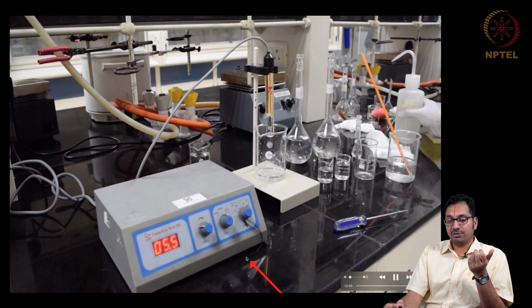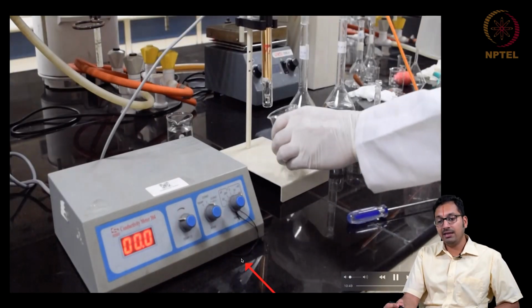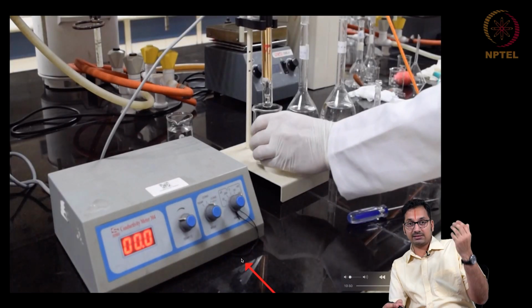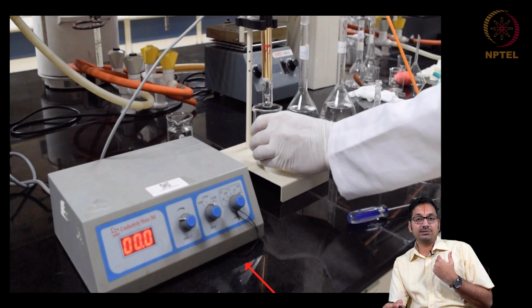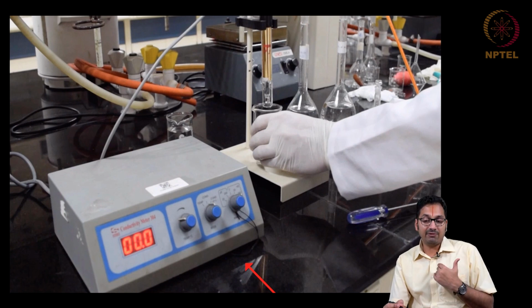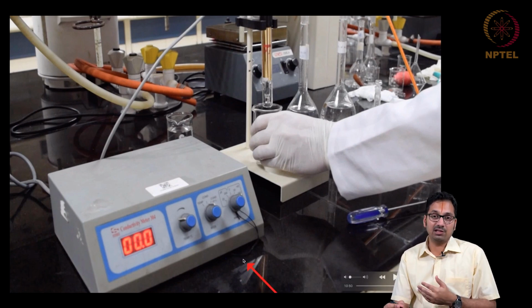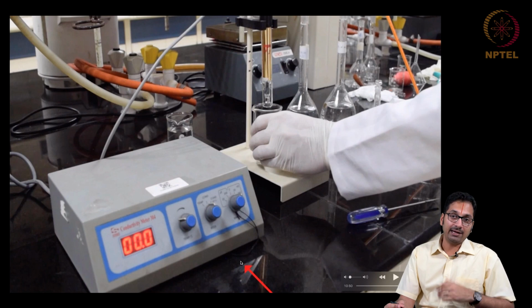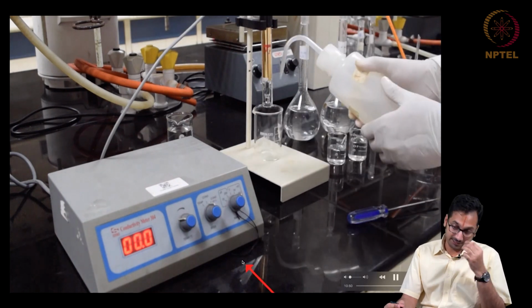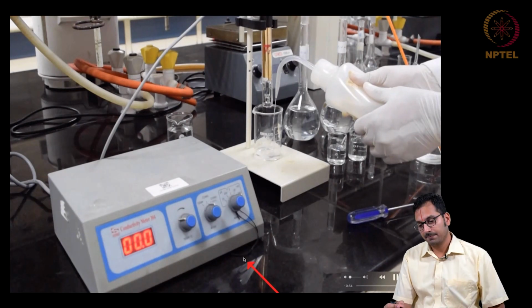Once again, you have to ensure that you wash the electrode gently and carefully and dry it so that any amount of water that might be sticking onto the electrode does not result in a measurement error. Once again, systematic. In this case, let's say more water or less water gets stuck, you might have an issue where the amount of SDS solution that you end up adding will be more or less. Actually, in this case, it will be less because you have some water that's going to end up diluting the solution with which you are working.